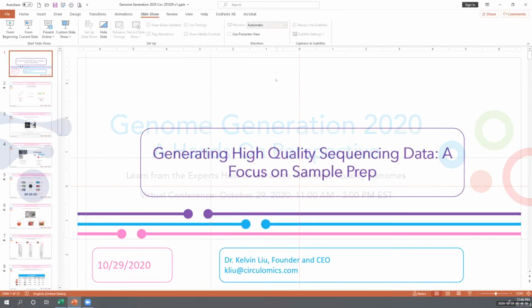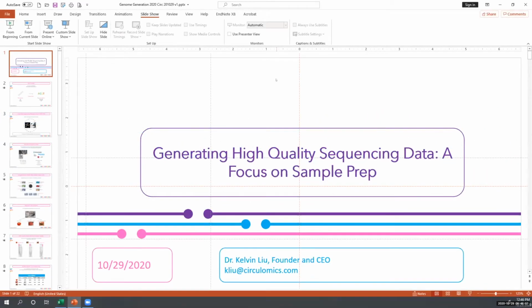Thanks for the intro, Jeff. All right, so I'm going to talk a little bit today about how we approach sample prep, and as an example, I'm just going to walk through two projects that we've done recently. One of them is on PacBio, one of them is on Nanopore, and the different ways that you approach sample prep in those projects.